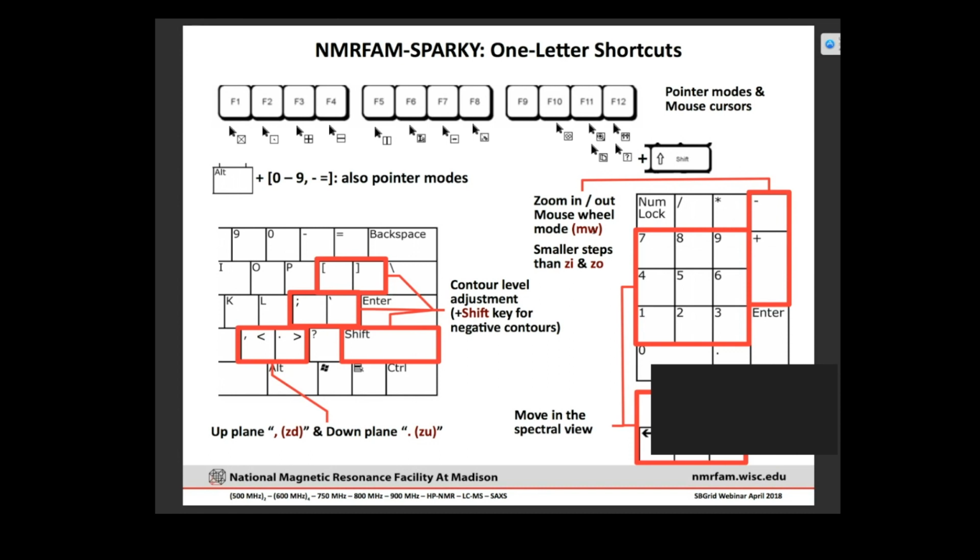For Mac machines, mouse wheel acceleration is really not useful for zoom in and zoom out because by accident, if you move your mouse wheel too much, then zoom in or zoom out can be too much to see anything in your view.